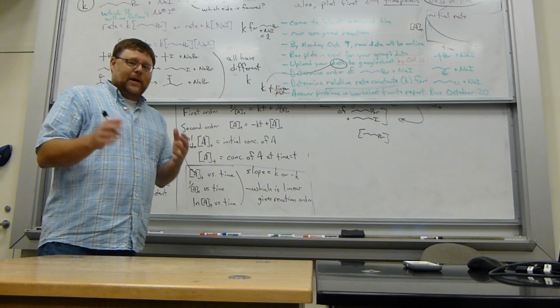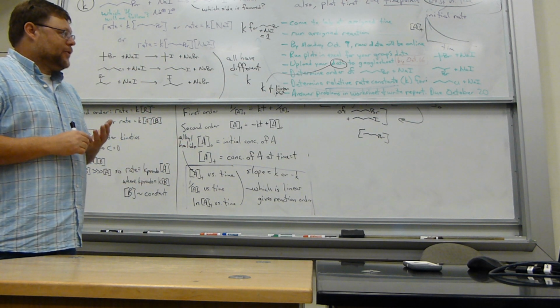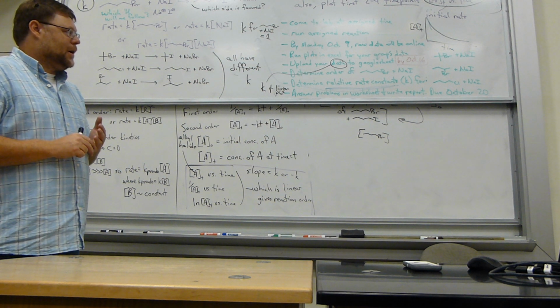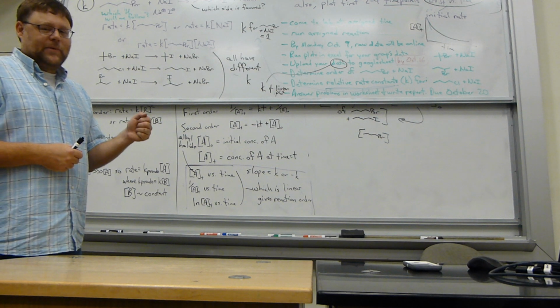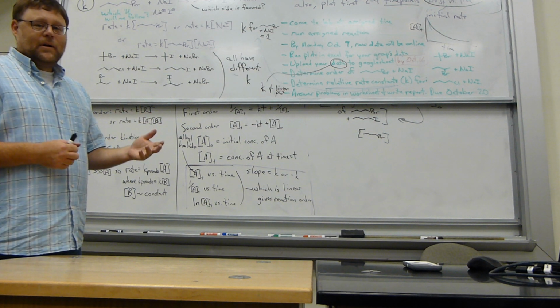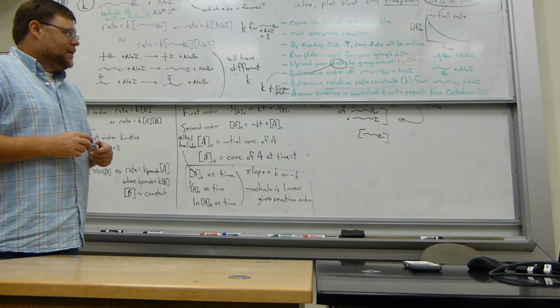You'll come in, like I said, in a group of 4 or 6 on Friday, October 6th. You will, basically, a couple of you will mix some chemicals up, hand an NMR tube to Dr. Wright. He's going to run the NMR. We're all going to stand there and watch it.